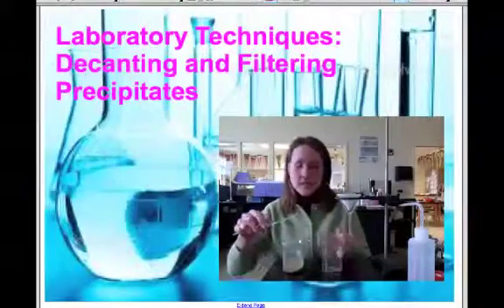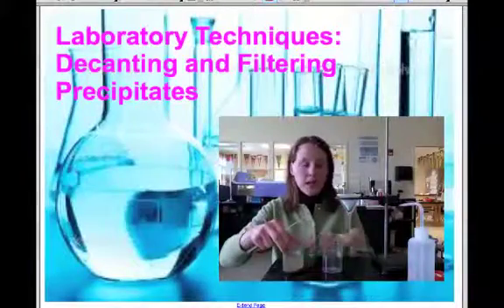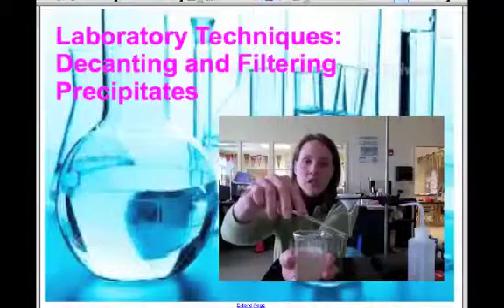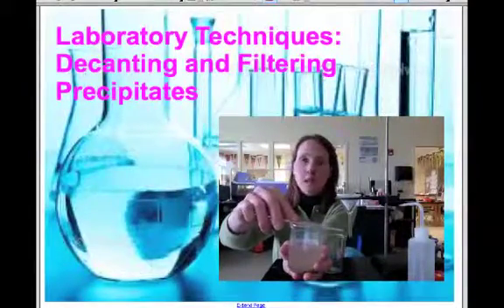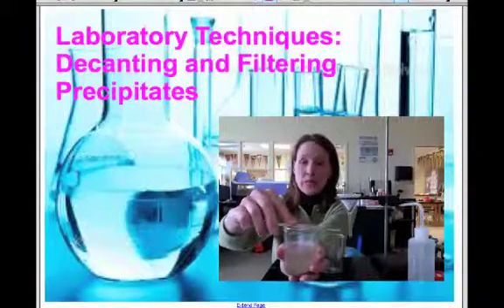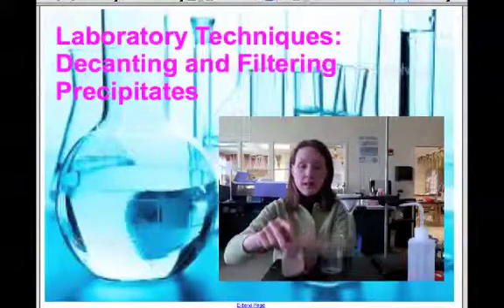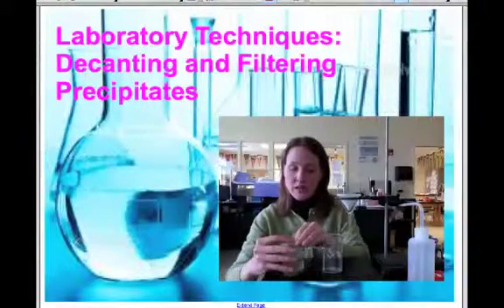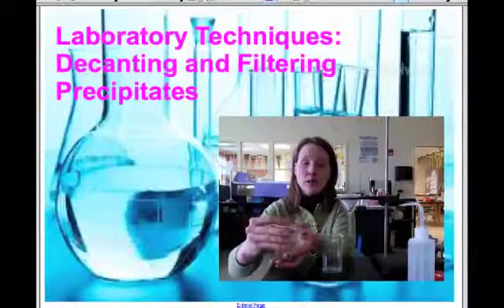Now, the next step in this process is I take a glass stirring rod and I place it over the beaker like this. I make sure that part of it is touching the spout and another part touches the glass opposite the spout. So the next part is a little bit tricky because in one hand you will need to hold the glass stirring rod like that and also hold the beaker. So you can move your hand and rearrange it so that that works.